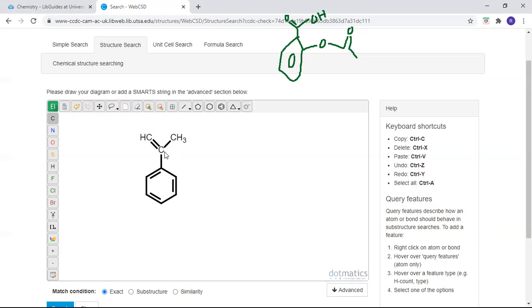So what I'm doing is I'm just clicking and dragging and adding. So now we have the double bond, the single bond. We want to change these to oxygens. So notice how this one put an OH on it. So if it does this, this is not correct. So we're going to erase it. And we're going to click oxygen and select double bonds and then drag. And now when we put the oxygen, it has it.